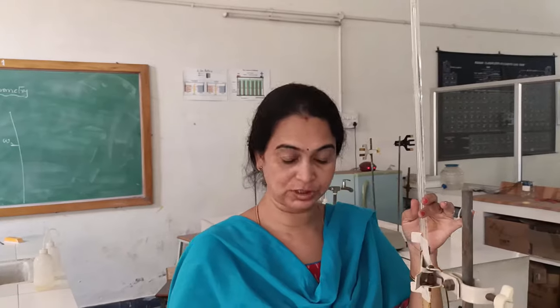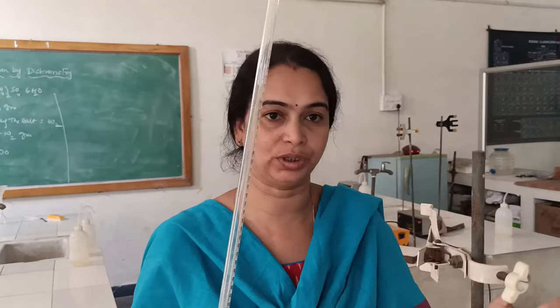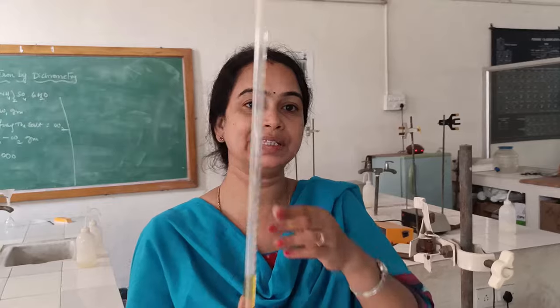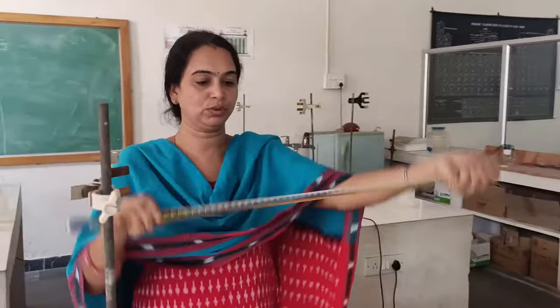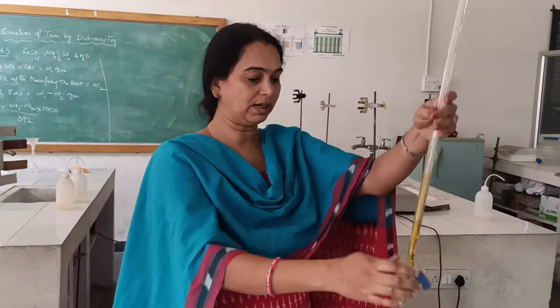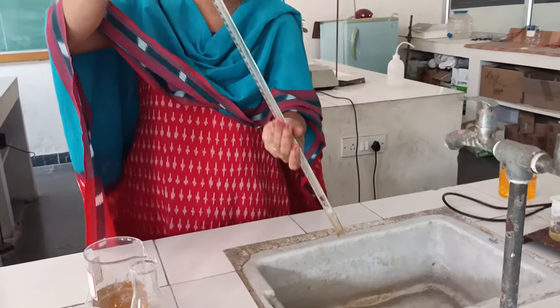This is how you make the standard solution of ferrous ammonium salt. You are now done with the first step — preparation of standard FAS solution. The next step is standardization of potassium dichromate solution. You have handled burette, pipette, and conical flask in your intermediate classes. For the burette, wash it with tap water, then rinse it with distilled water and throw it away — this is called rinsing. Now rinse with the dichromate solution, adding a little amount and passing it through the nozzle, then discard.